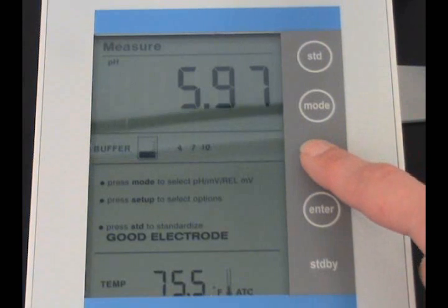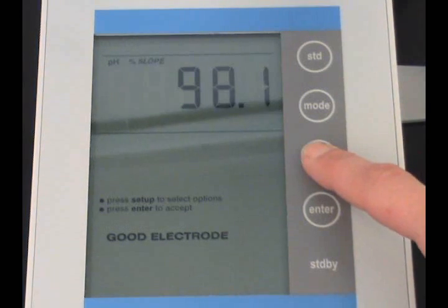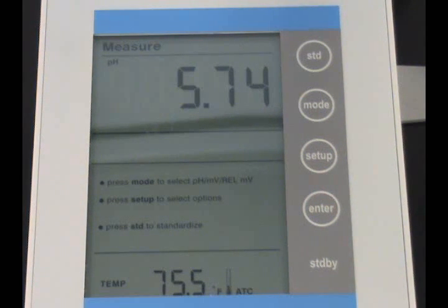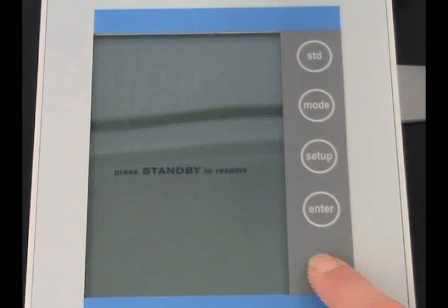Press the setup key twice and then enter to clear earlier calibrations. Turn the meter to standby.